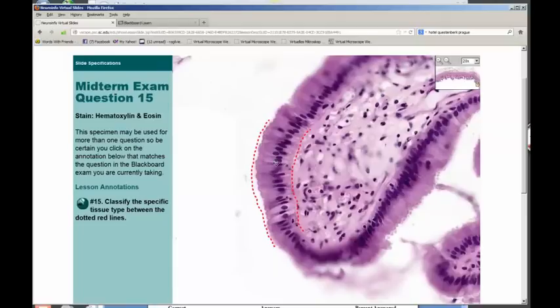And so the cells are taller than they are wide. So it's very straightforward, I think. Simple columnar epithelium, not pseudostratified. Do not get confused by a minor representation of this whole tissue. Always consider the entire thing. In fact, we just outlined between these 2 dotted lines, so we were trying to steer you away from over here. Okay, so the next question is question 16.